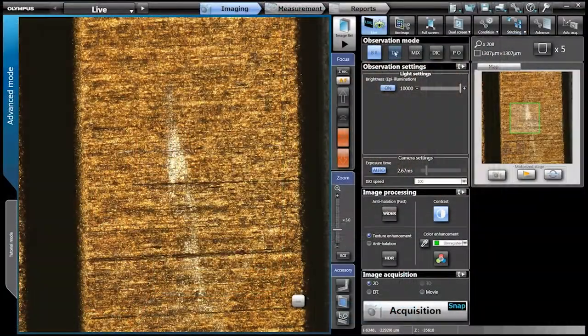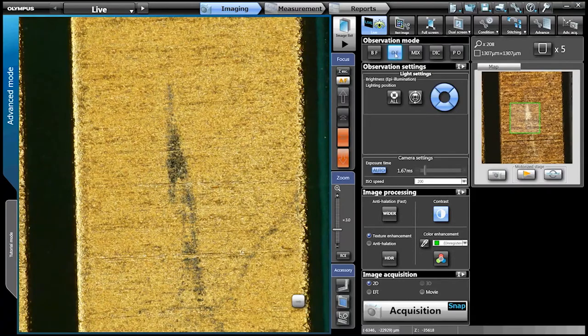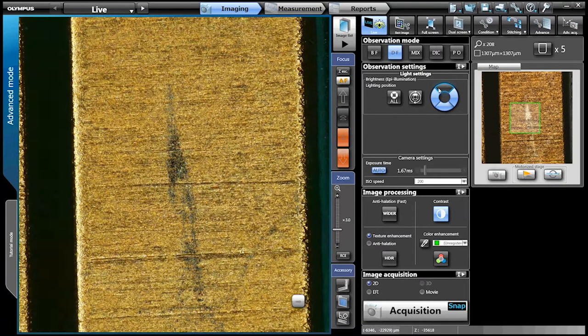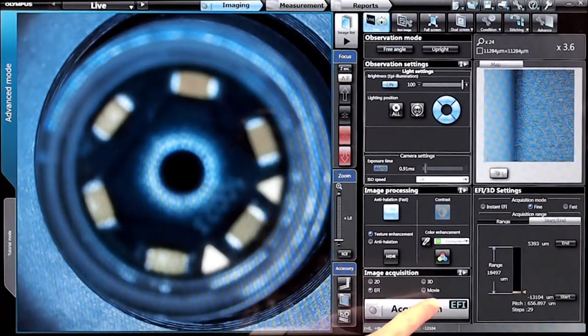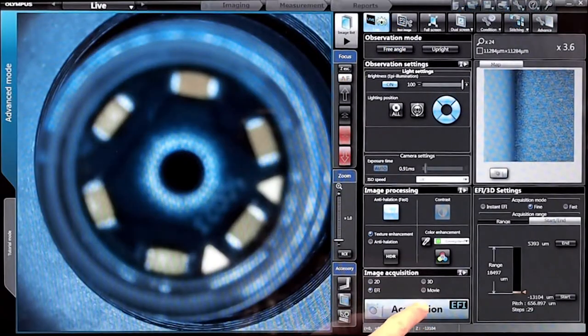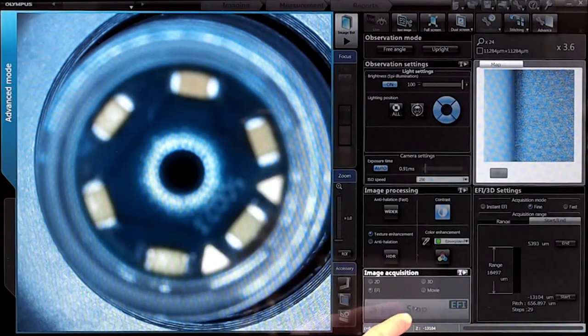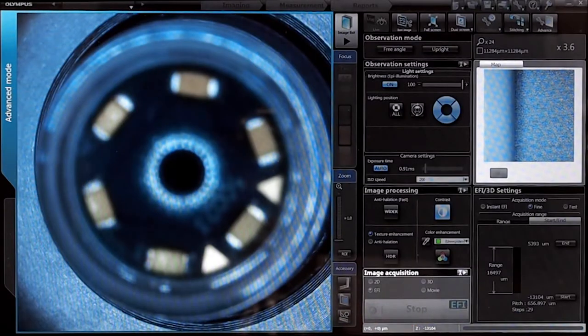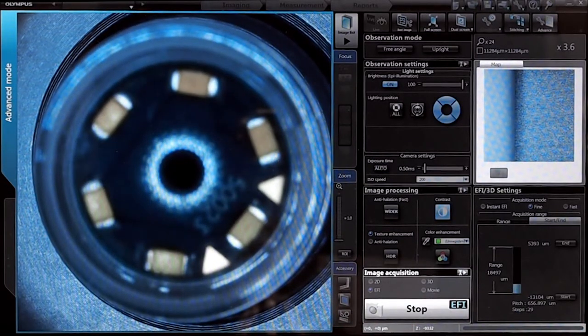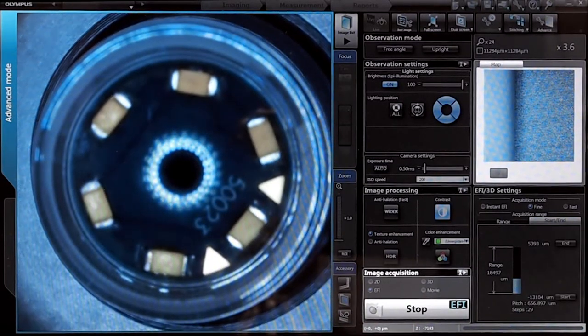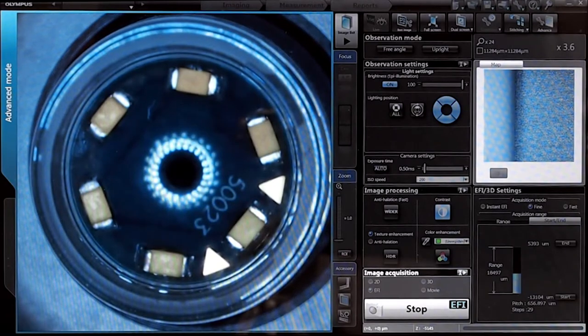Four high-powered observation modes make your job just a touch easier. Extended focal imaging lets you capture images in sharp focus across varied topographies to let you see all levels in focus at the same time.